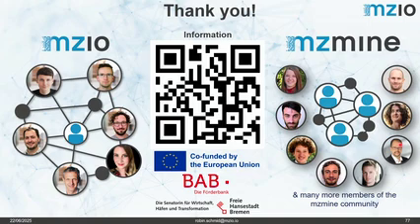And if you reach out to a community like mzmine, MatchMS, R for mass spectrometry, there's different communities for different languages and different things, reach out to those communities and do it early. I did it too late. I had already programmed so much, and then later I reached out to Tomáš and he was inviting and gave me feedback for the first time on my code. And that's tough sometimes, right? Getting feedback, but it really made me a better programmer. And I guess it's the same working in a tandem.